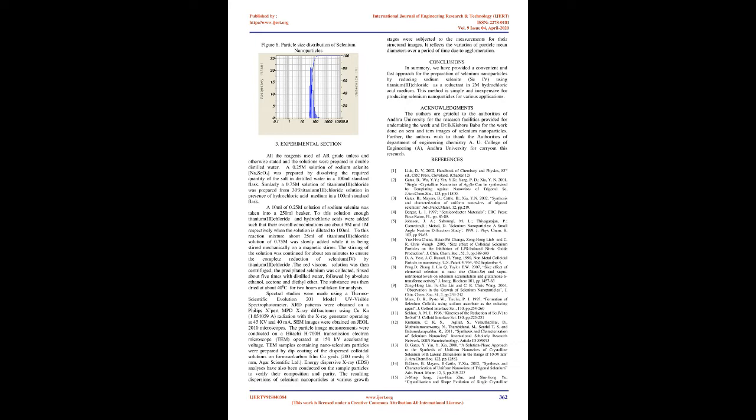The formation of these t-Se seeds relieved the level of supersaturation, and the following growth of residual a-Se colloidal particles present in the solution would occur on these t-Se seeds. Therefore, we reason that the strong dependence of the morphology of t-Se on the amount of Se in DEG solution should be ascribed to the variation in the amounts of both a-Se colloids and t-Se seeds. The TEM images shown in Figure 4 reveal the agglomeration of the particles in solid phase, whereas in liquid phase there is a good separation of selenium nanoparticles.